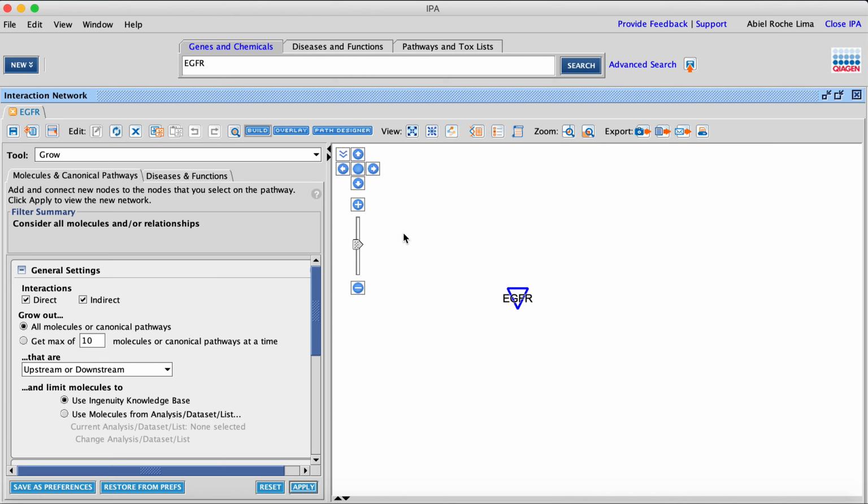But you may represent a pathway as a network, but it will not give you directionality. What starts, what ends, what the secondary interactions are, what the products are. So it doesn't give you enough information to construct an orderly cascade or orderly process. So the pathways serve mainly for that purpose in terms of how IPA chose the data. But networks are essentially very good to represent what genes are associated with a disease, what genes are associated with a function. So in this case, we can do it both ways.